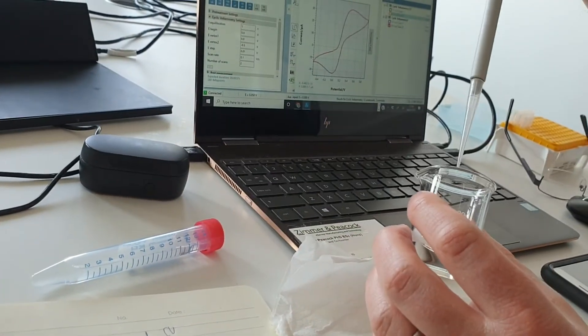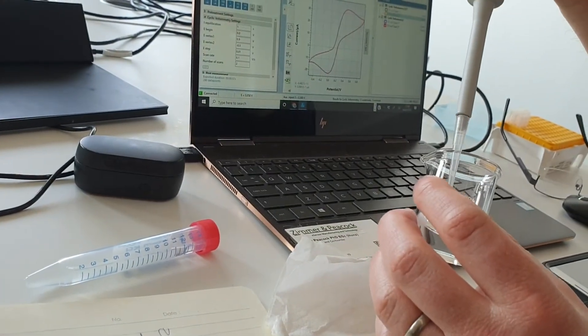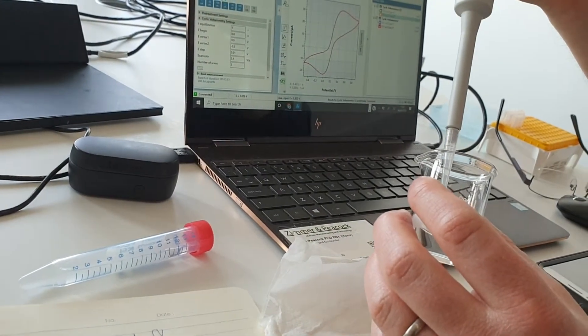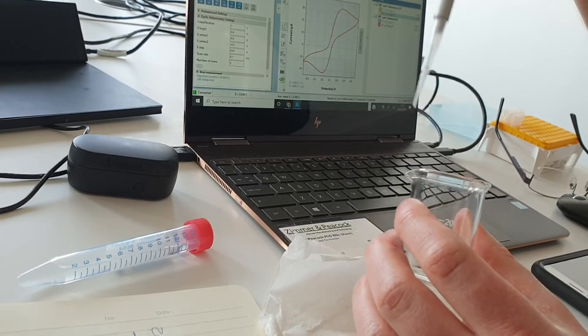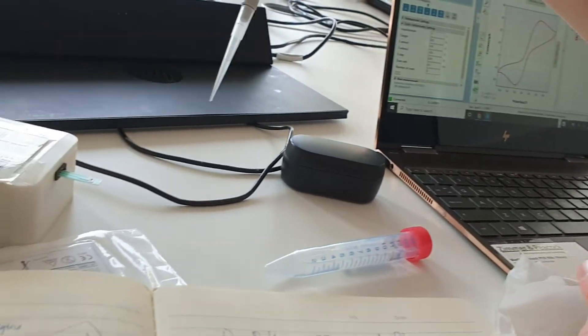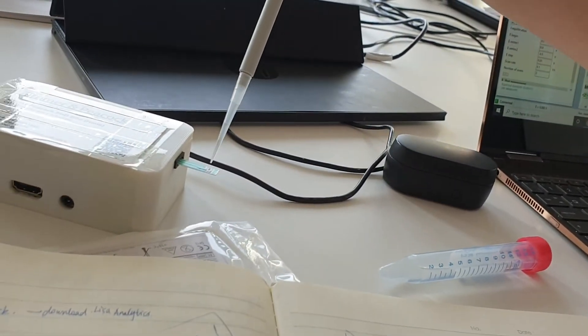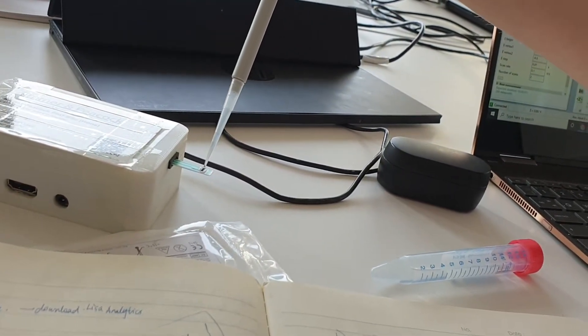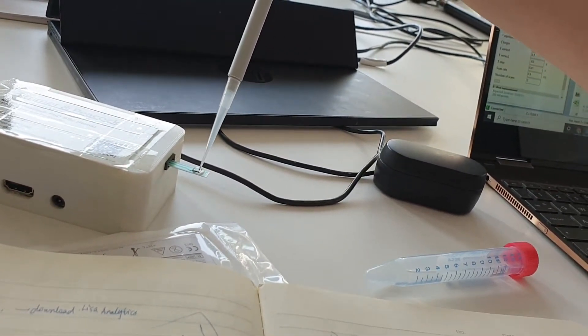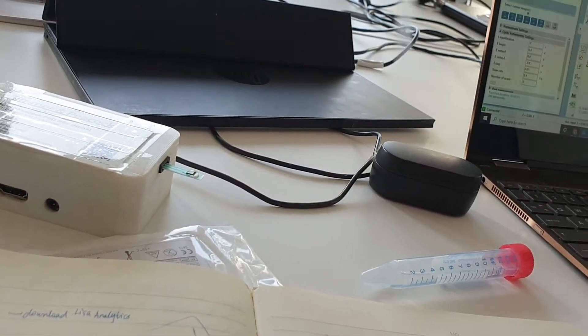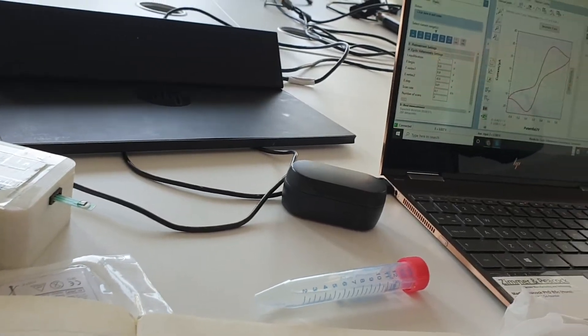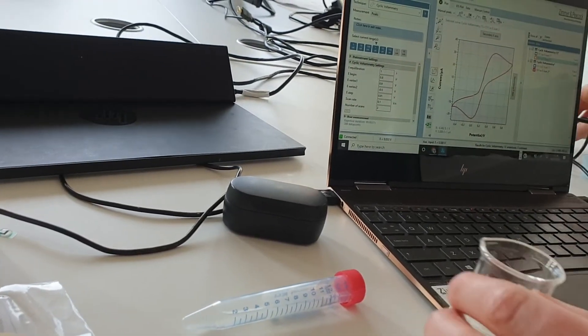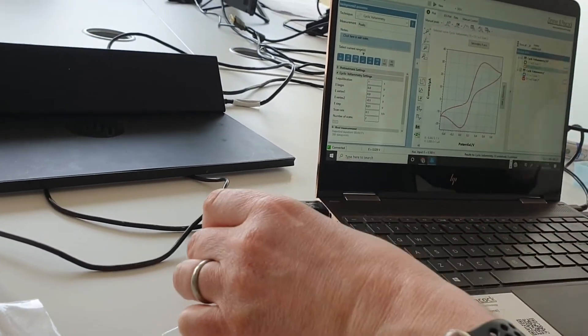Oops, yeah, the buffer. So this is just PBS 7.2 pH. You pipette it onto the tip of the electrode like that, very straightforward. We'll come to our software.